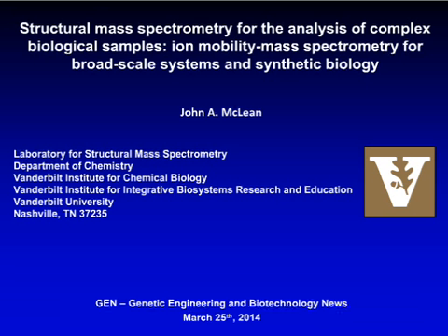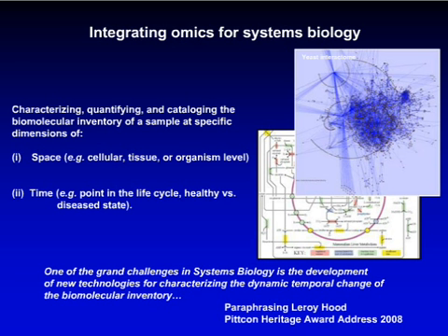When we're talking about systems biology, this is the idea put forward by proponents like Lee Hood, suggesting that if we can measure all of the molecular components, both in dimensions of space but also in dimensions of time, one might be able to sit down like an electrical engineer and work out the circuit diagram of life.